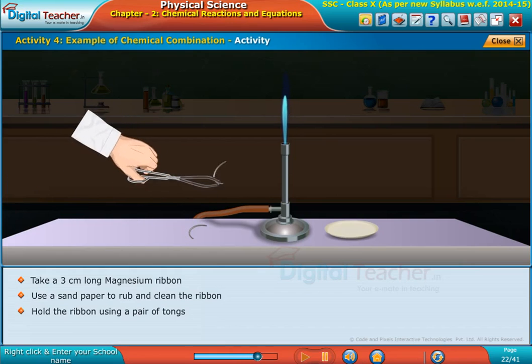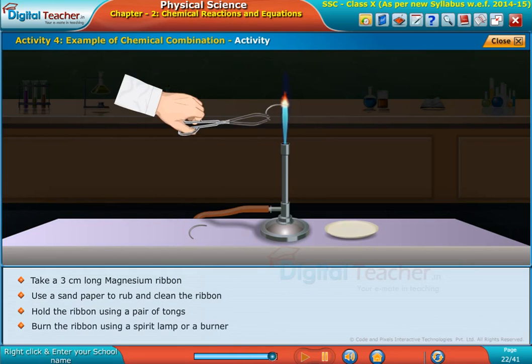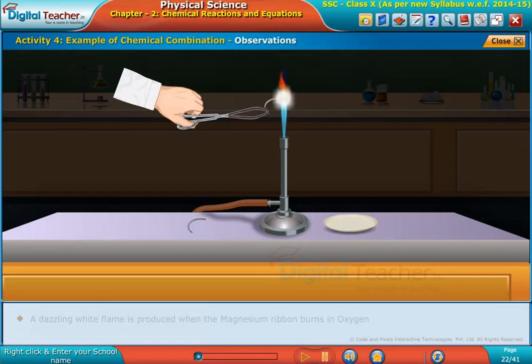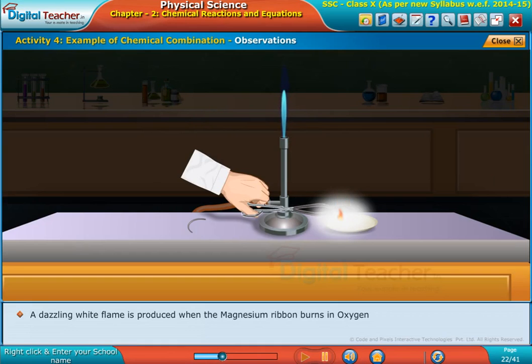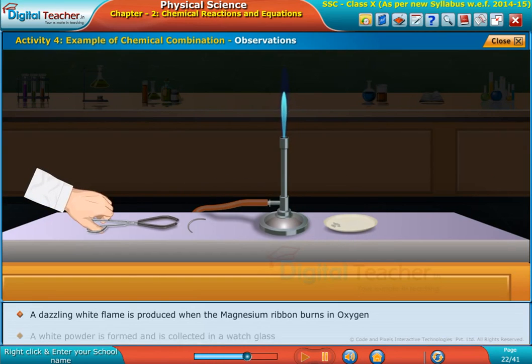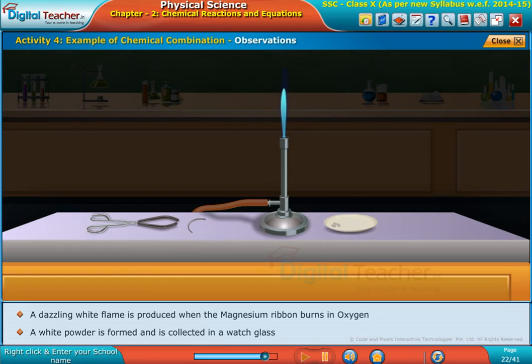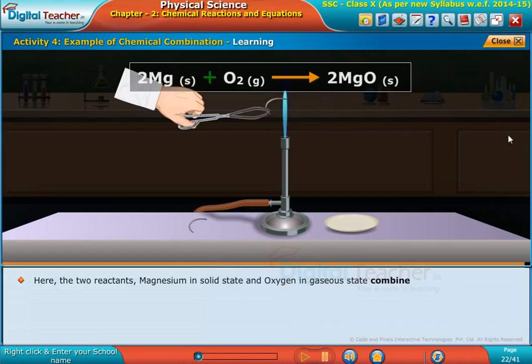Burn the ribbon using a spirit lamp or a burner. A dazzling white flame is produced when the magnesium ribbon burns in oxygen. A white powder is formed and is collected in a watch glass.